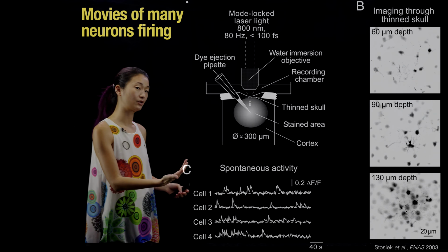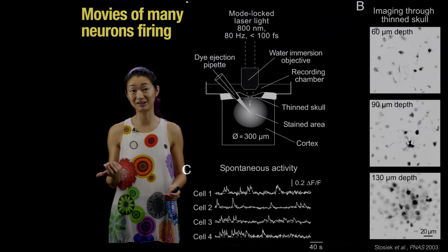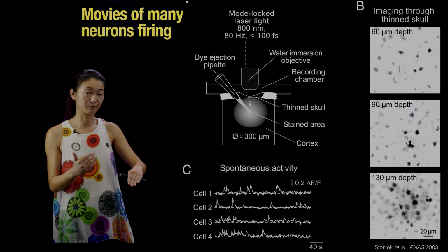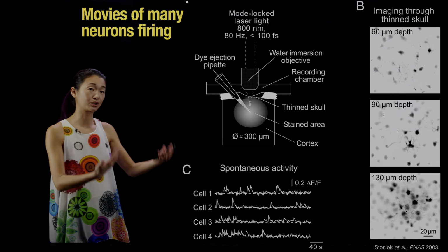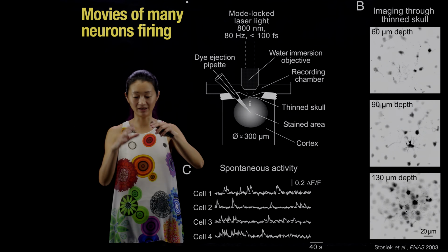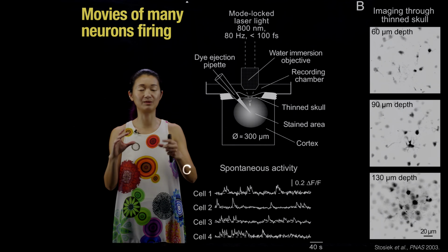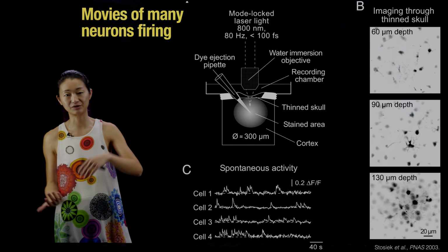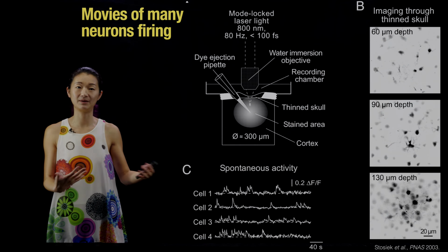Depending on how fast the neurons are firing and depending on the kinetics of your GCaMP, you can scan through a volume of brain to monitor the electrical activity, the neural activity of those neurons in a pretty large volume, depending on how fast everything goes, depending on how fast your lasers are and how fast your optics are, how bright your GCaMP is, all of those things.